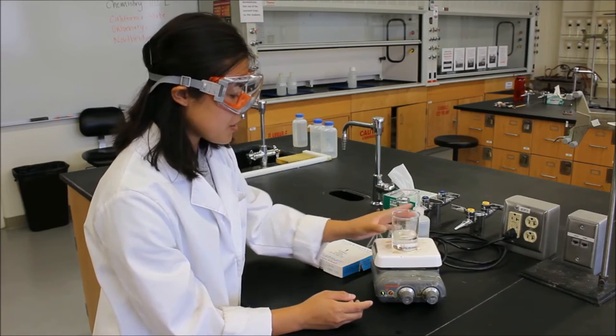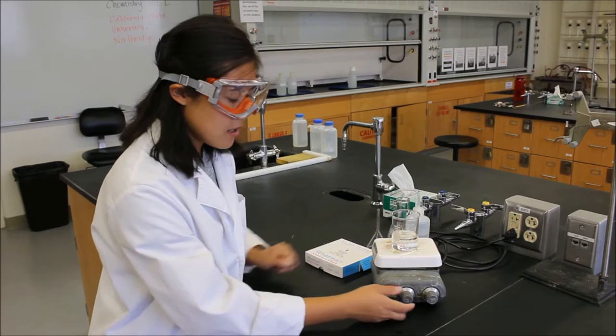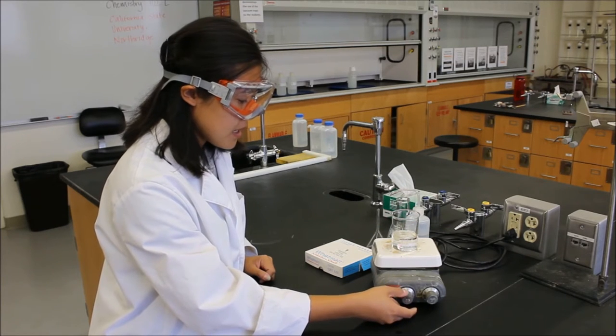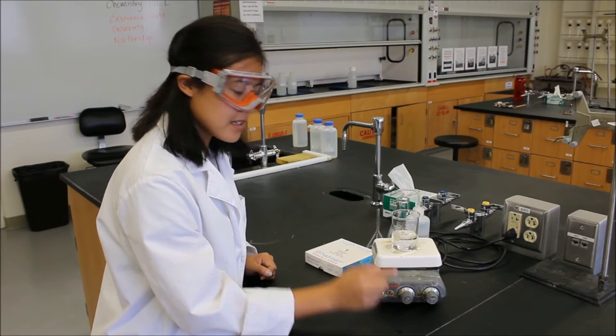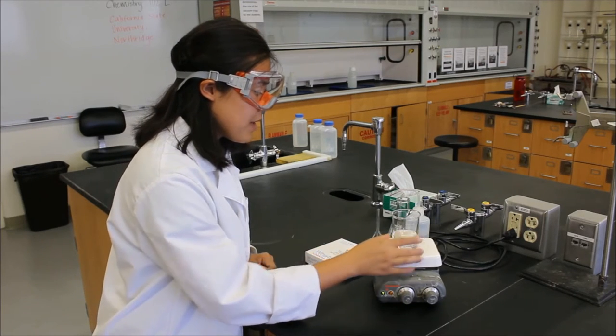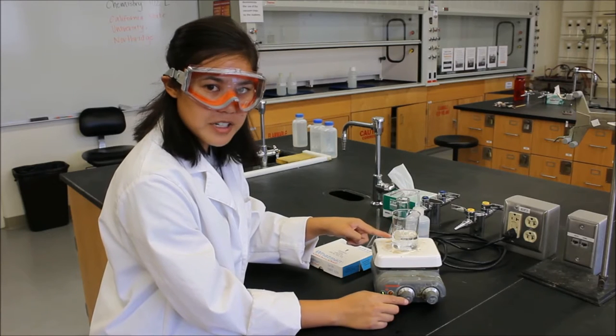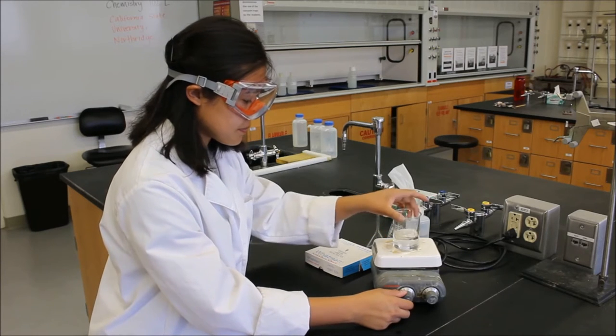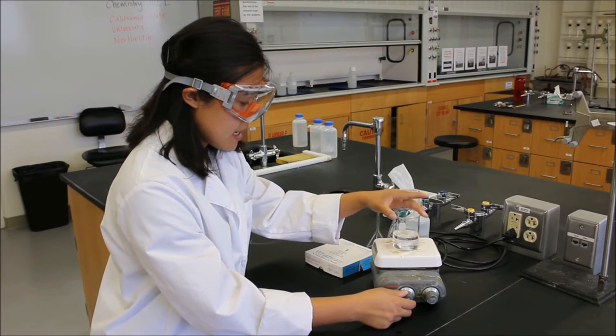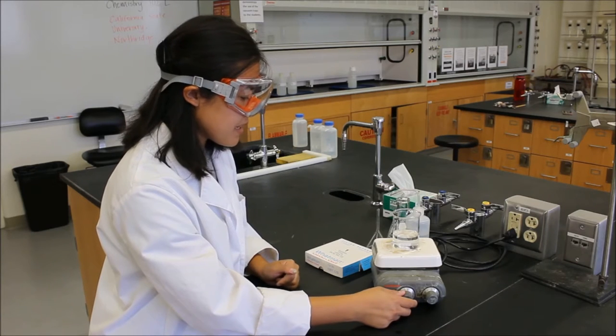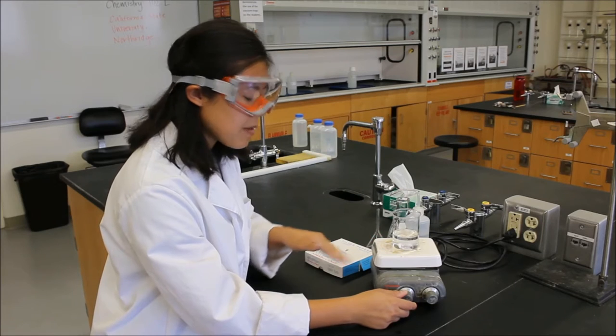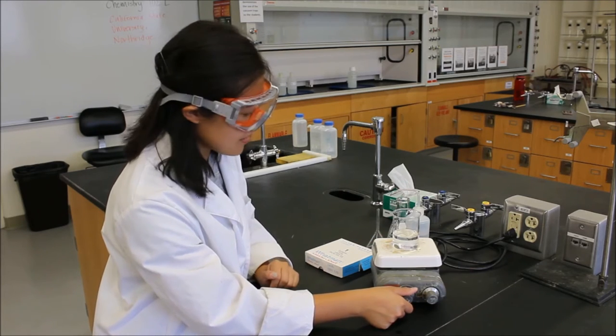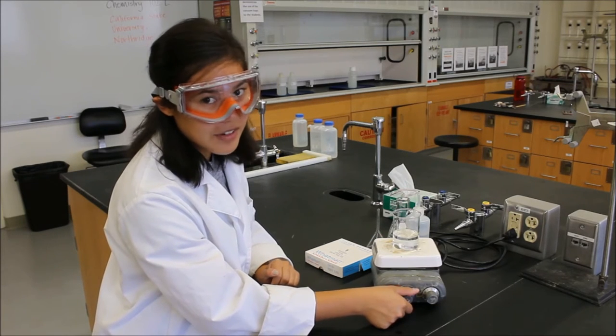So once we have our stir bar inside our solution, we can turn it on to stir. And instead of looking at the numbers, what we want to look at is the solution. We want to be able to see a small vortex in our solution. And we want it to be spinning fast enough so that we can see a vortex and it's mixing, but not so fast that it's splashing. Because once it splashes, we start losing solution. And that's never good in an experiment.